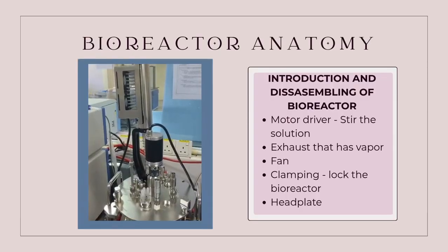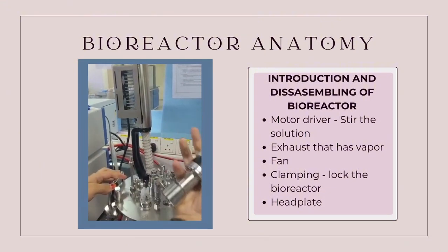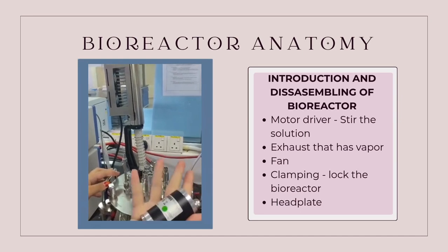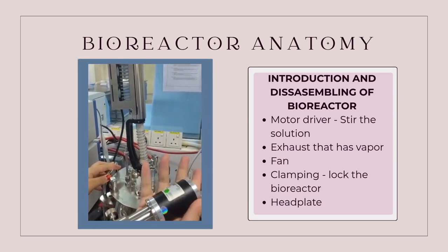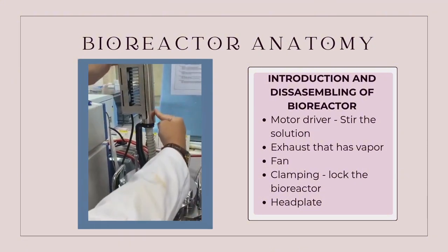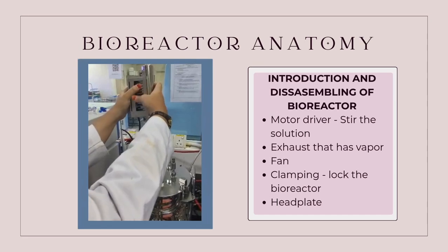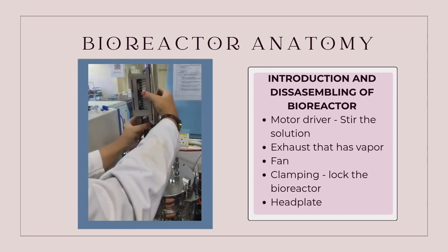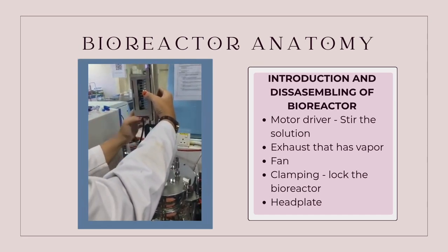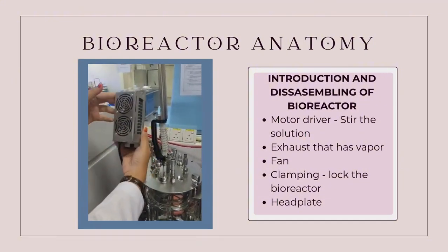Assalamualaikum and hi. Today we will present and talk about this bioreactor operation. So this is the motor driver. The function is actually to stir the microbes or any components in the bioreactor. And this is the exhaust, and it has a vapor inside it. And the component that we will take out actually has a fan inside it.